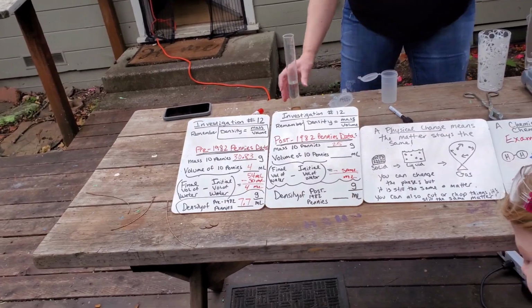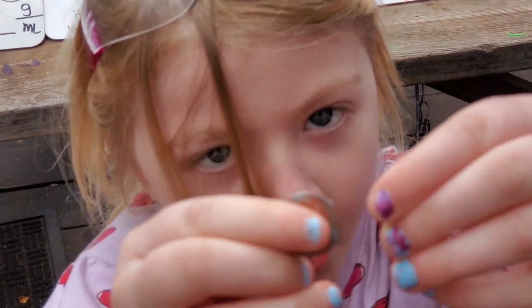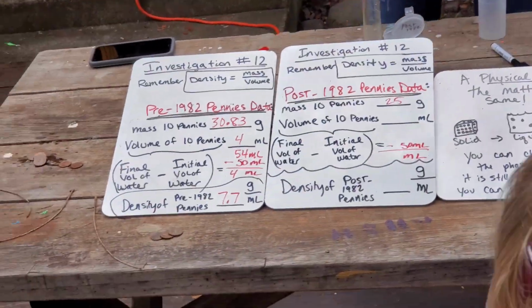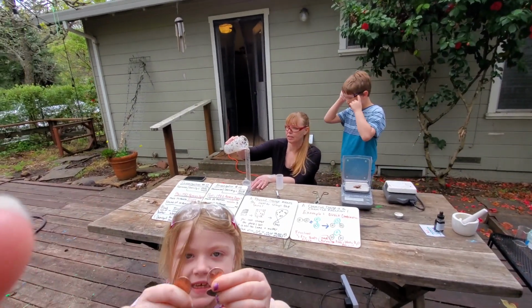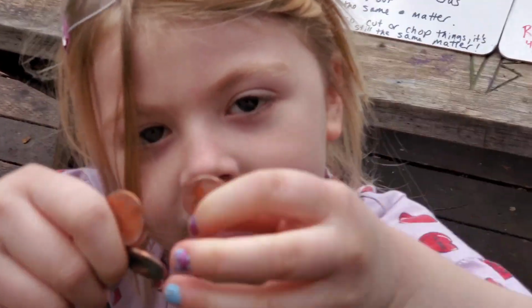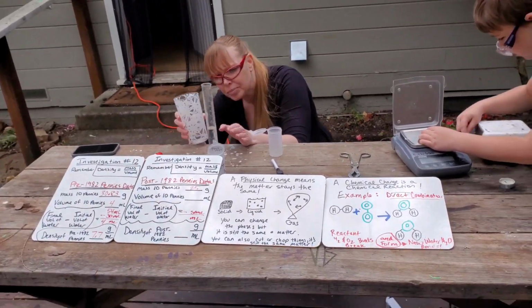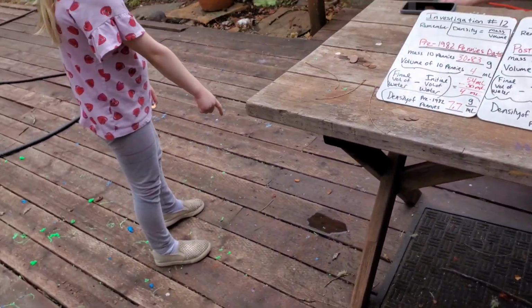And then we'll go ahead and dump out that water here. Guys, look how cool these are. Hey, don't hit me in the head with your glasses. Can you make sure there's 10 in there? Look, Troy. Is there 10 on there? They're so cool. They're like painted. Whoa, something happened. It's just water. Yeah, there's 10.